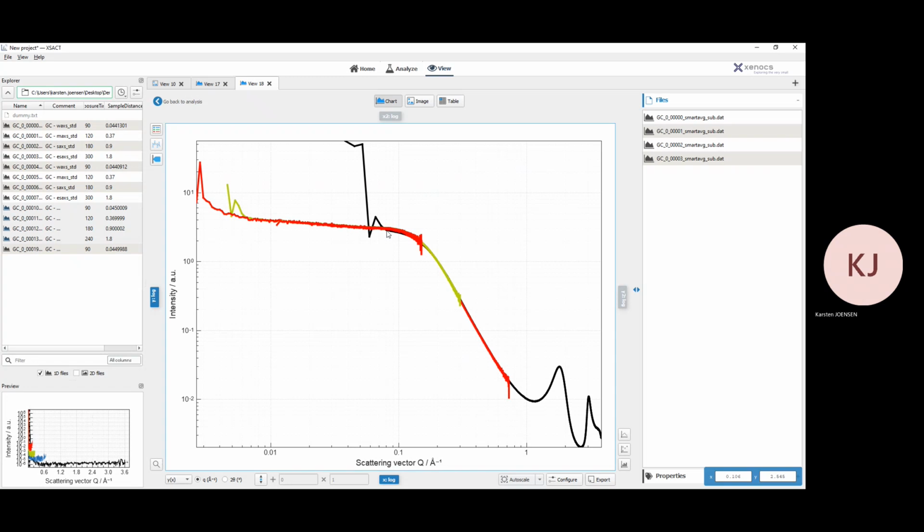Now, if we take a look at that, we recognize the steps that we had. If we take just a look at the black curve, we can see that the black curve runs up, and then there's some residual stuff that's going around on the beam. So the subtraction looks like it works well right to this point, and then the slight differences between, let's say, the strong parts of the direct beam means that this data here in this range for that measurement is not really trustworthy.